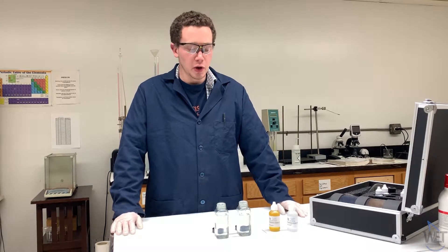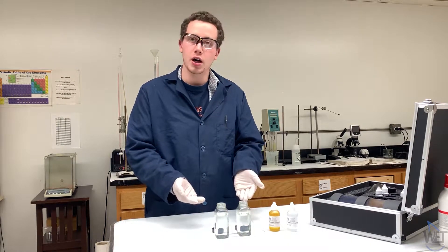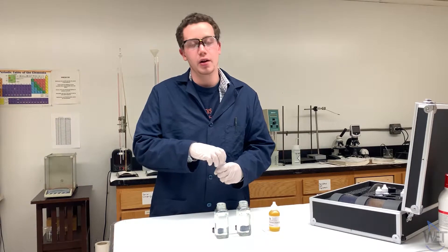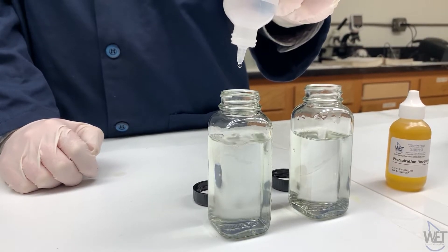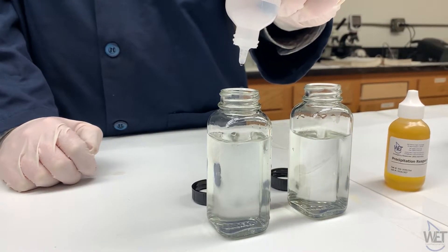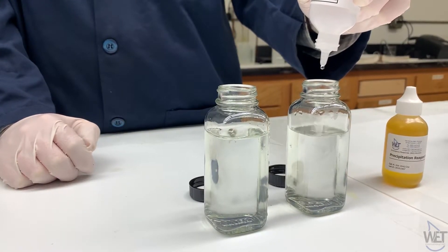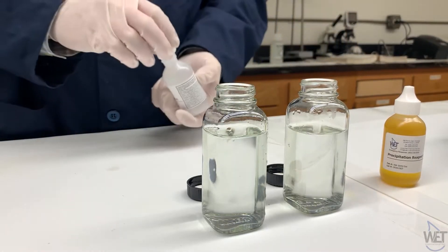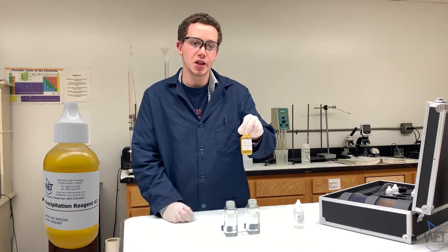For the precipitation reaction, you want to fill your glass bottles about three quarters of the way full with tap or purified water, then get precipitation reagent number one and add about 10 to 15 drops of it, and then 10 to 15 drops of precipitation reagent number two.